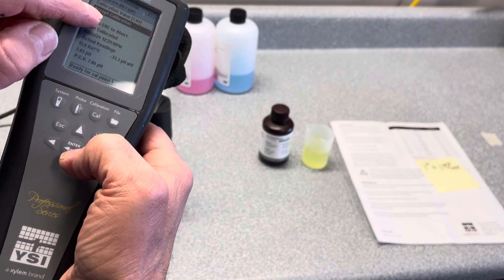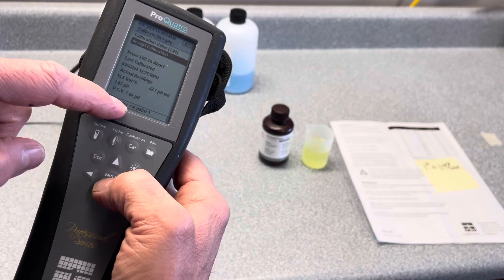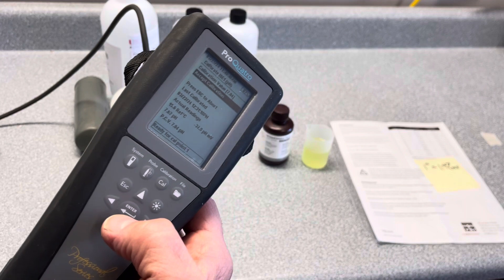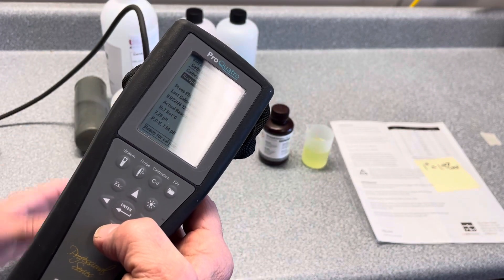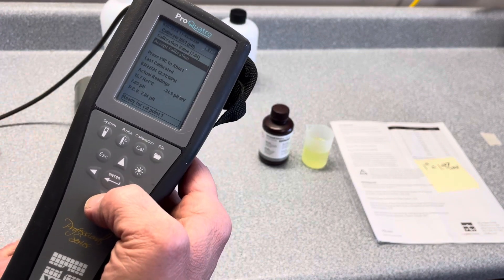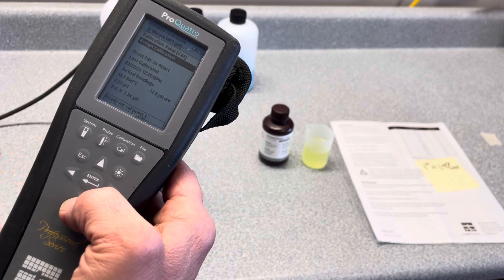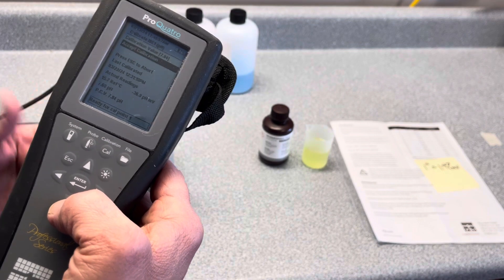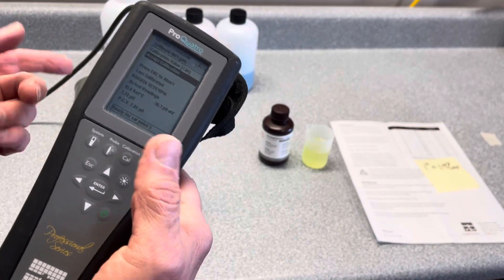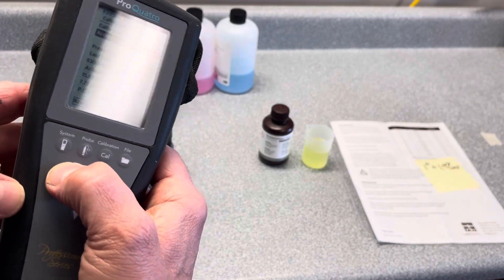Then come back down and hit accept calibration, and it's going to say 'ready for point two.' Go through the normal process of switching out solutions, making sure everything is clean and rinsed with DI water. Then do the same procedure for the second cal point, and if you want to do a third, repeat that for a third. It's always helpful, especially with YSI, to begin with pH 7.